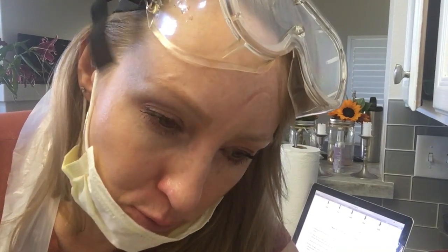This is microbiology. This is week 2, lab 2, but part 1 of the video, if that makes sense. This is on the bacterial enumeration, dilutions, and plate counts. So the first thing we did was pour the agar plates, which I did yesterday.